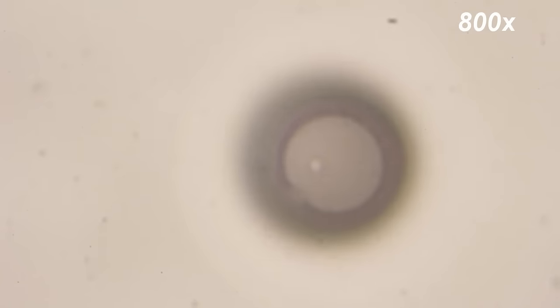So now we're going to the filtered water. And what I did is I had a hard time to focus so I found an air bubble. And so this is an air bubble, a very small air bubble. This is at 800 power and there's nothing here. There's nothing. It took everything out essentially. And so we have clean water.